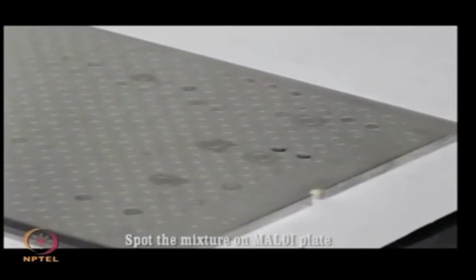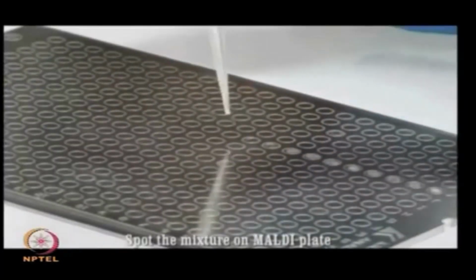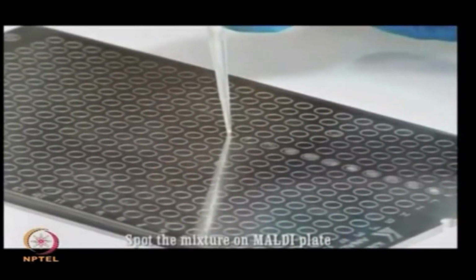This mixture is dried before analysis and the liquid solvent used in the preparation of the solution is removed. So, in this video, by depicting the matrix preparation as well as the instrumentation, we will try to give you an overview of the MALDI TOF instrumentation. So, spot the mixture on the MALDI plate. How uniformly you can plate these mixtures on the MALDI plate ensures good spectra and data quality later on.